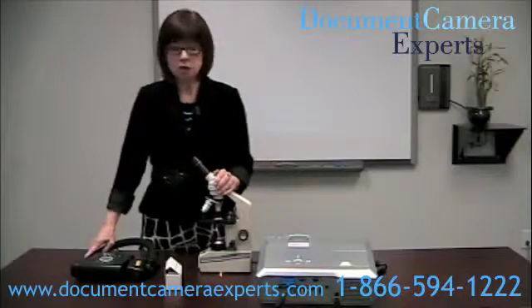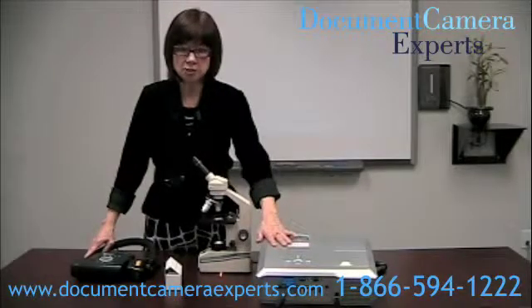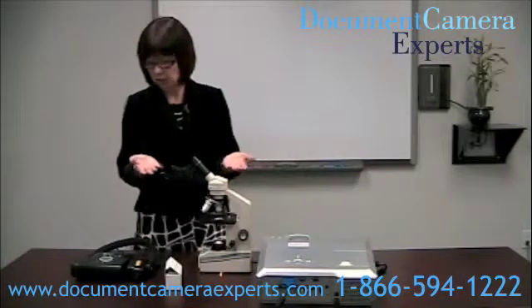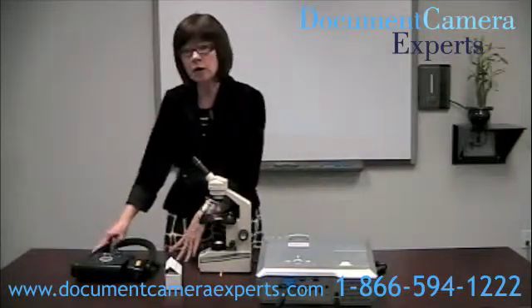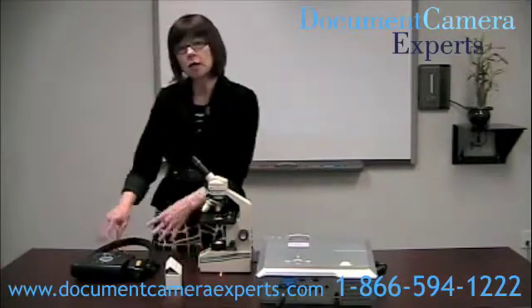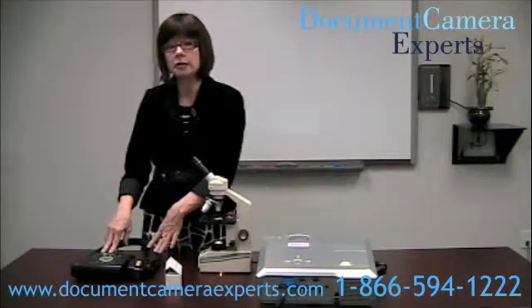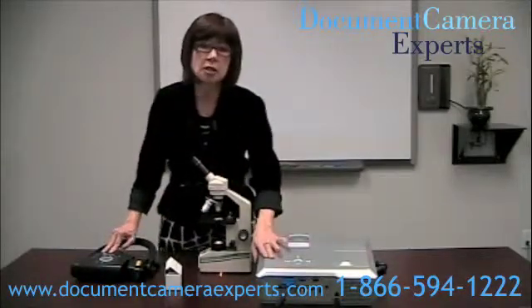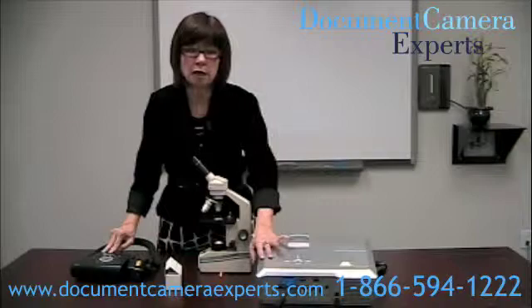Before we start, we're going to make sure that we've powered on the projector. We have power to the microscope because we want light coming from underneath, and we've also powered on the document camera. I also have attached a VGA cable that goes from the RGB out on the AverVision CP300 to the projector, and I put it to the in port on that machine.